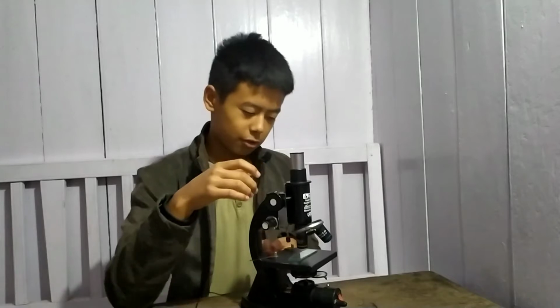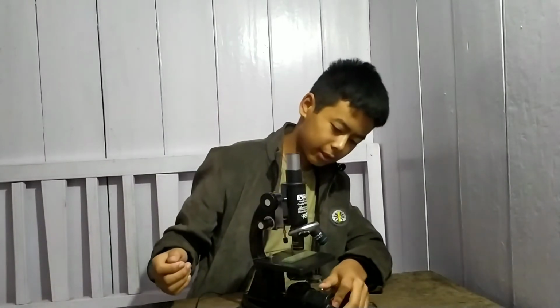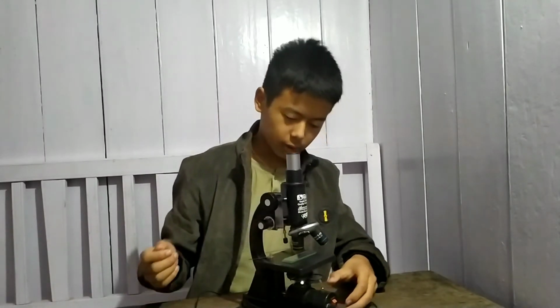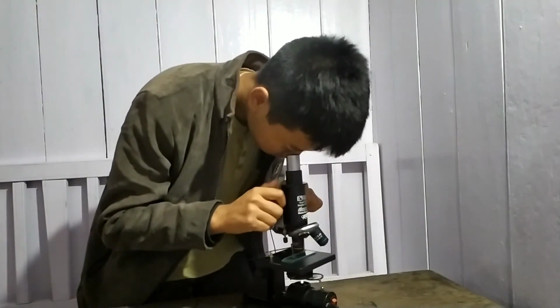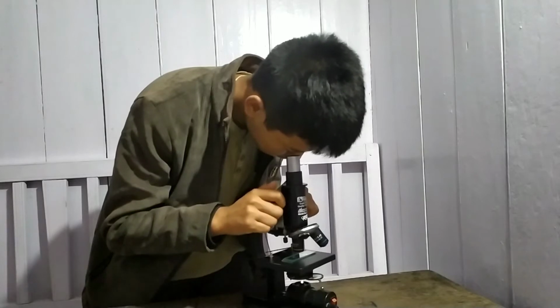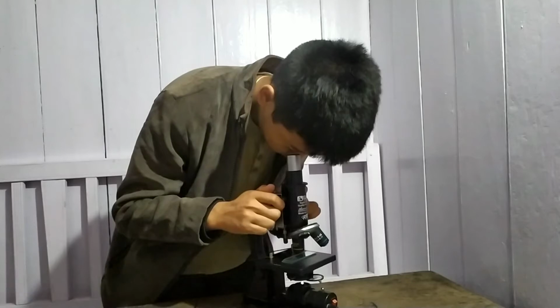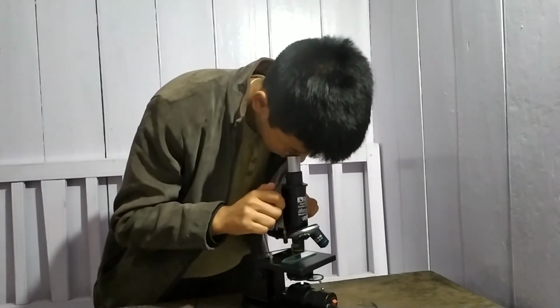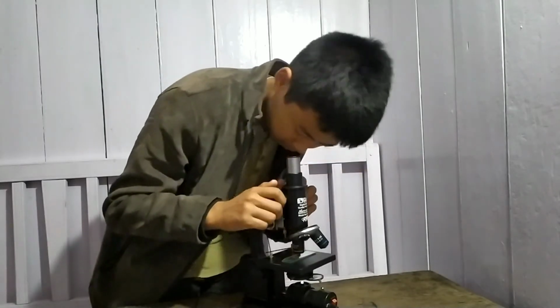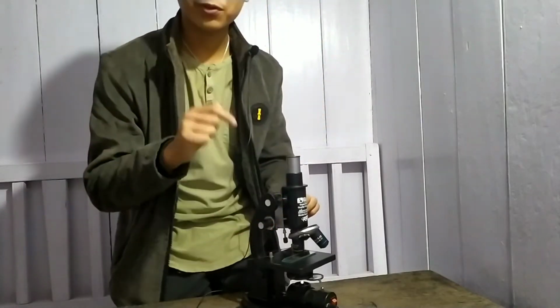So let's stop the talk. Okay, I'll not clip it because those organisms will die. Okay, I'm turning on the light. Okay, I'm focusing it. Oh, they are kind of moving. Okay friends, let's see these organisms. Okay friends, you can see it.